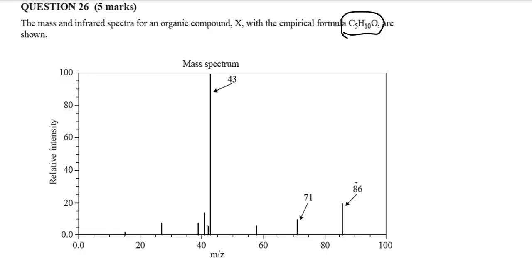But I can see because of the small number here in my mass spec, that this probably is going to be C5. Okay, so let's have a look what we do here. We find the highest peak. Now QCAA is not going to make it too difficult for you. So they've already indicated the three major peaks. So we want that 86. It's our mass for the compound.